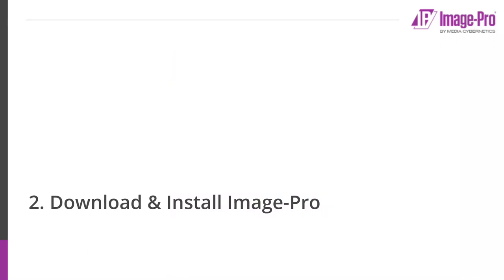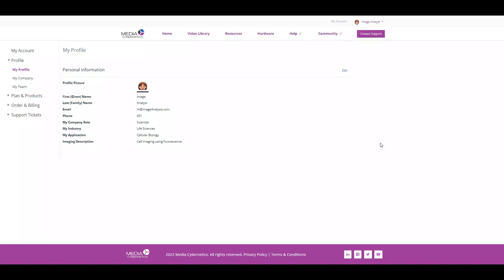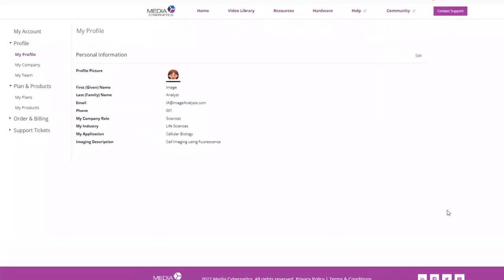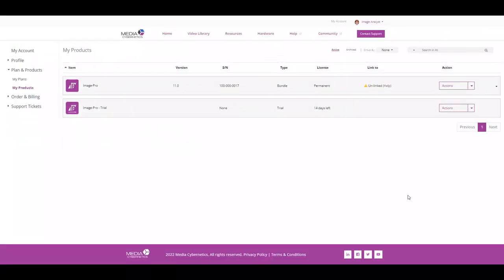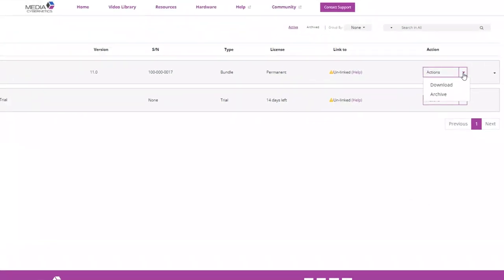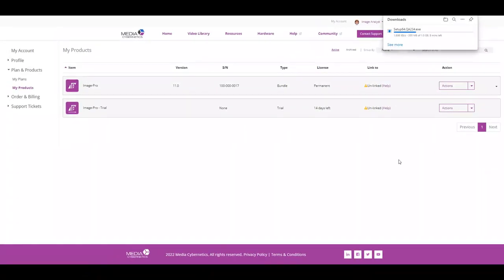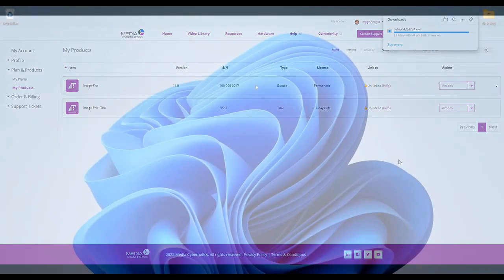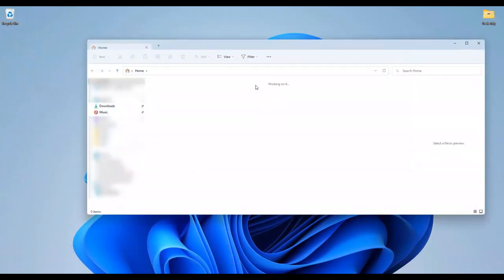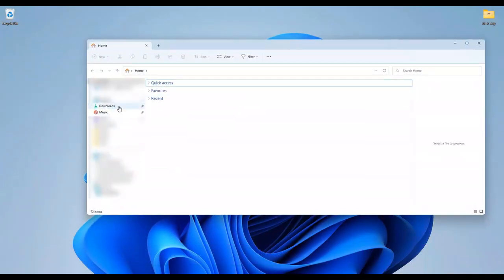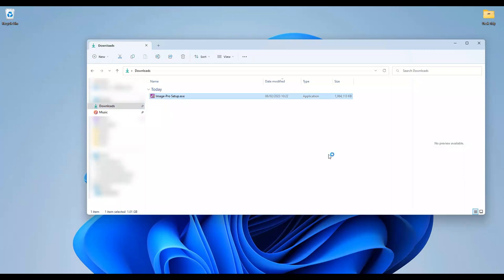The next step is to download and install ImagePro. Expand the Plans and Products dropdown on the left and click on the My Products link. Click on the Action menu of your license bundle to download the ImagePro installer. Open your Downloads folder and install ImagePro.